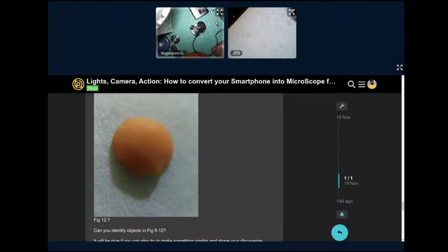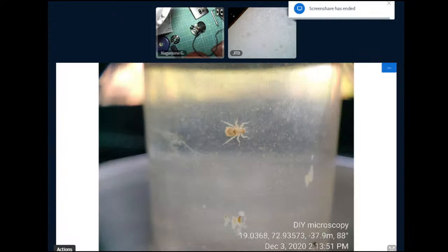Yeah, I know. So Gian, did you try changing the distance between the bead and the camera lens? How can you do that? No, what I would want to do is, once the side light is prevented, then I can actually try to look at a slide. Because the light should come from the other side now, because there is no scope for the light to come from the camera side.